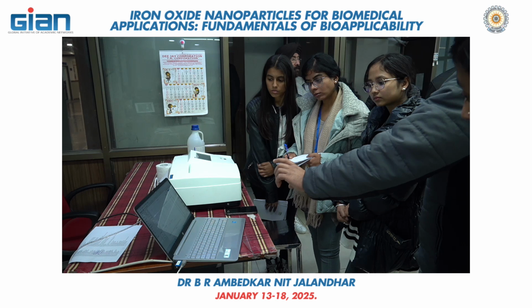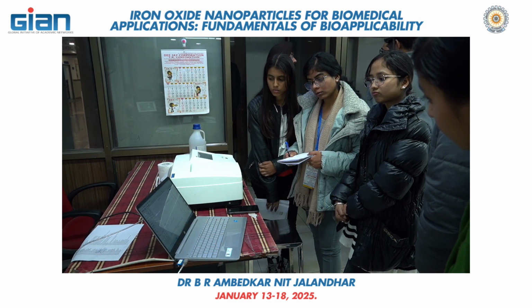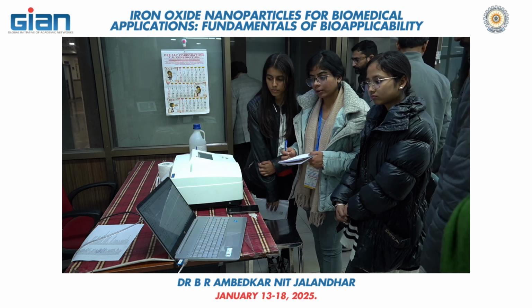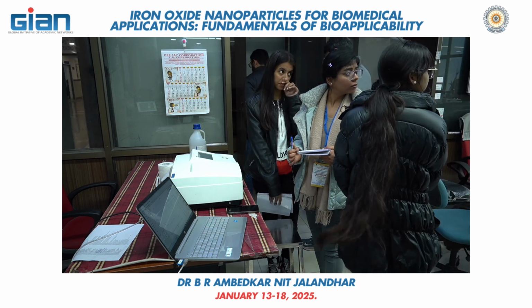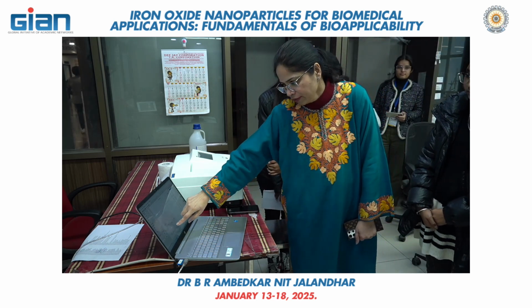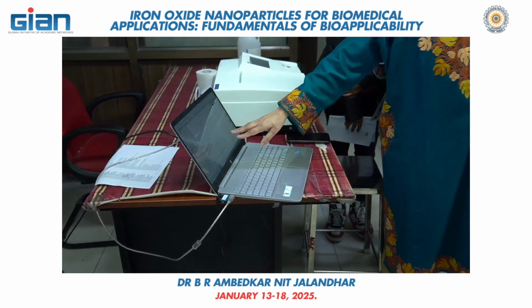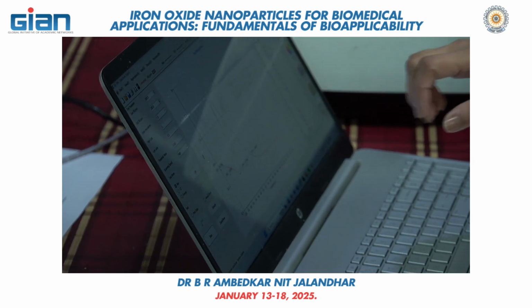You can put your group number. You can add the group number, and simultaneously the UV is also there. You can see the peak at around 400, right? So this belongs to the silver nanoparticle. Silver nanoparticle.